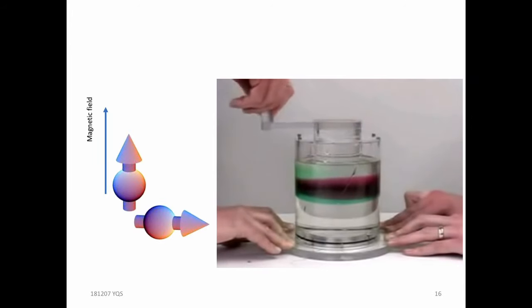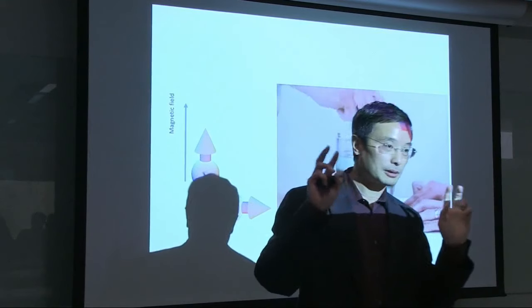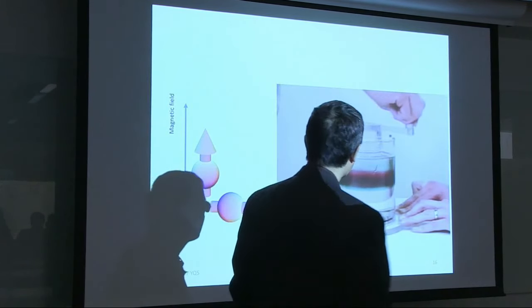And notice that at some point, this person just reversed the rotation. That's like our 180-degree pulse. They reverse the time axis.